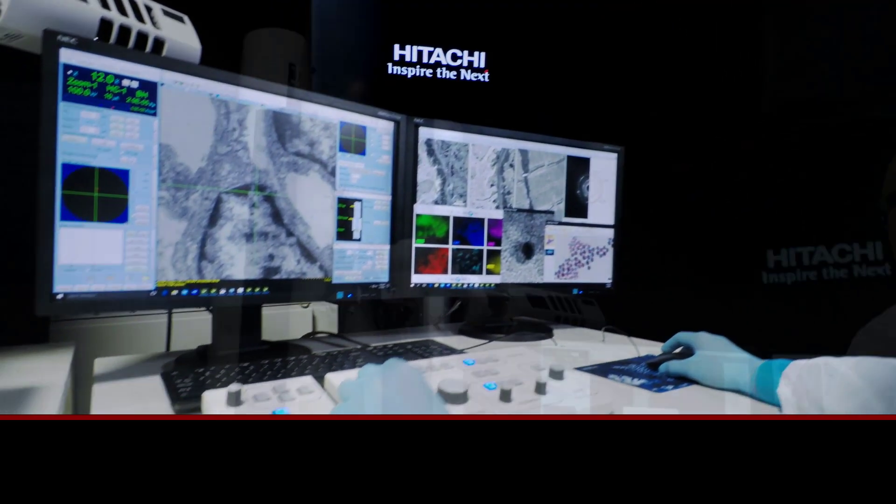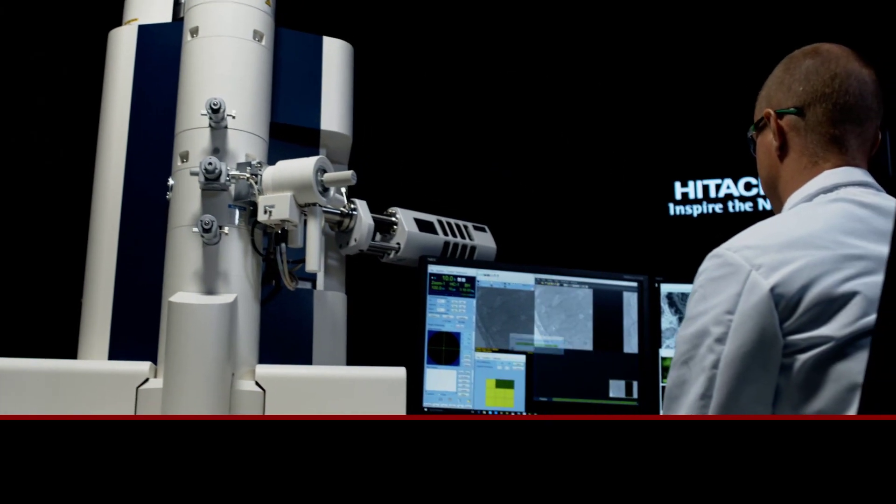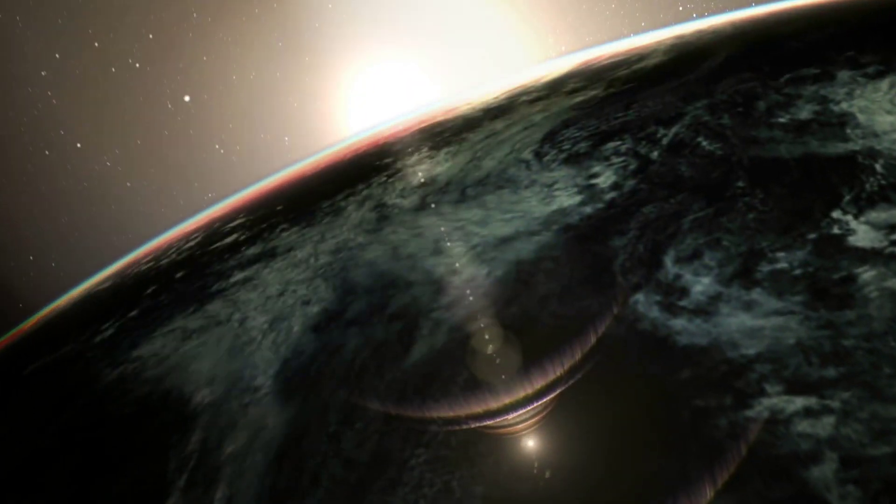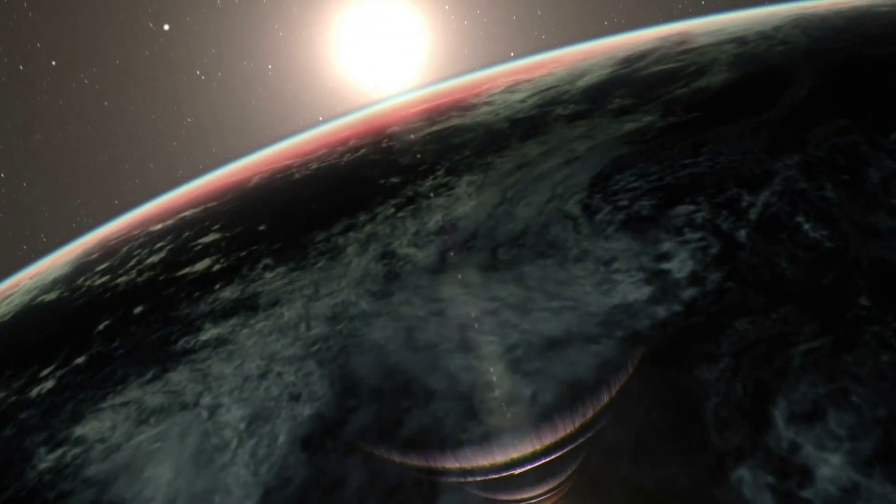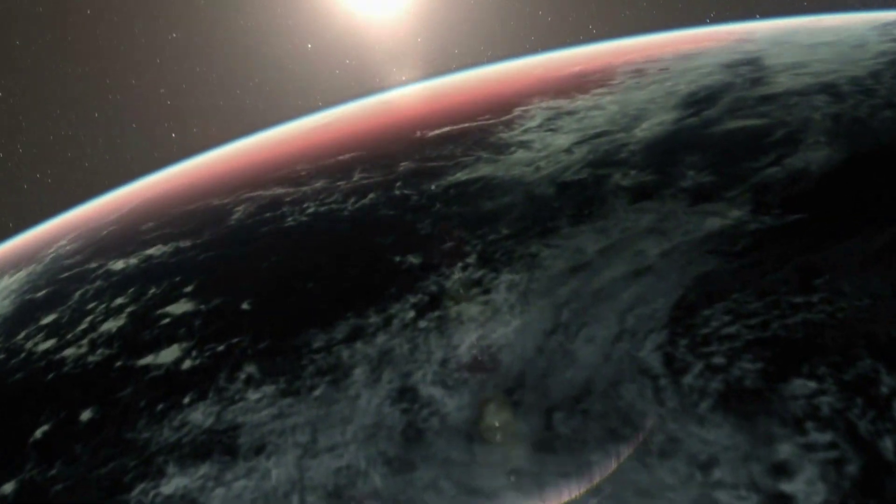With the HT7800, you can overcome the challenges of biological, materials, medical, and analytical imaging with ease. Think outside the lab. Hitachi. Bringing modern technology to a modern world.